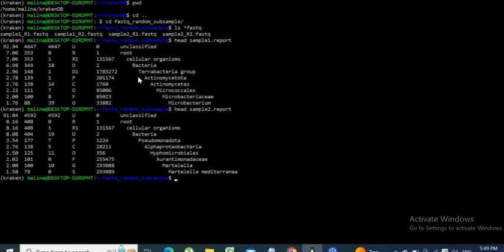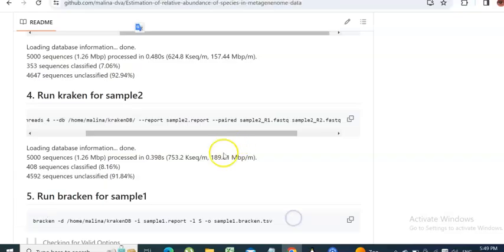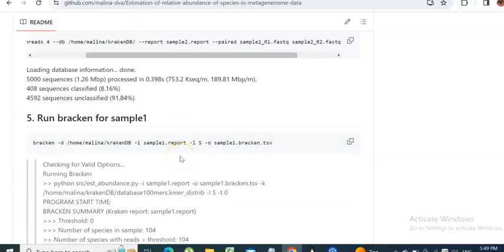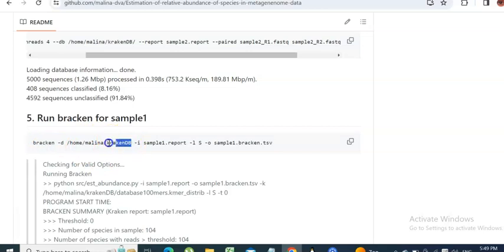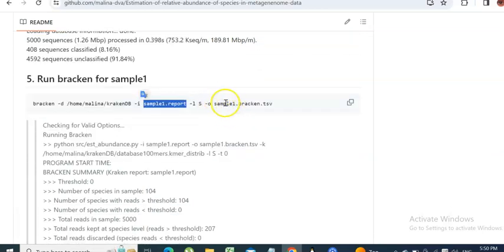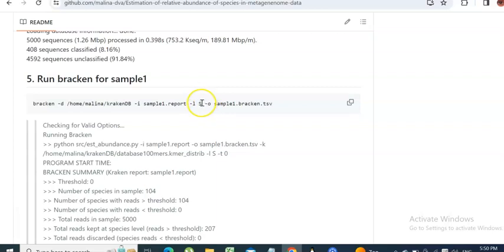The input for Bracken is the Kraken report. We have a database path with the Kraken and Bracken k-mer indices, then the Kraken report as input for Bracken. We also have the L argument, which stands for taxonomic level. In this case I chose to look at the species level.